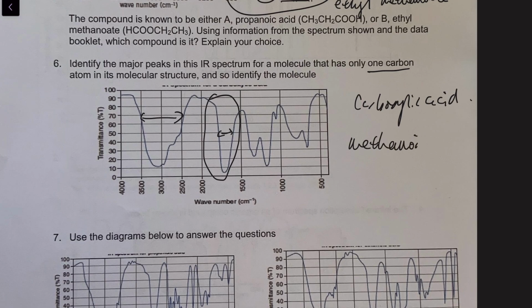Question 6. Identify the major peaks in this spectrum for a molecule that has only one carbon atom. So only one carbon. And you see this very broad absorption. Also, the C=O double bond. So you know it is an acid, so it is a carboxylic acid. Only one carbon atom, so it is just methanoic acid.